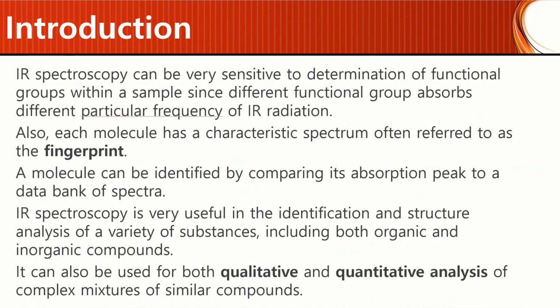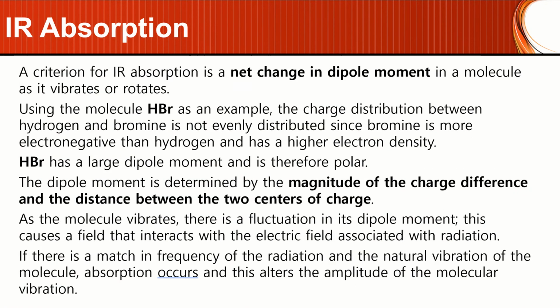It can also be used for both qualitative, so we just saw qualitative by looking at the spectrum, and quantitative, which we haven't looked at, analysis of complex mixtures of similar compounds. So it can be qualitative, which we have seen, and it can also be quantitative, which we haven't looked at yet.